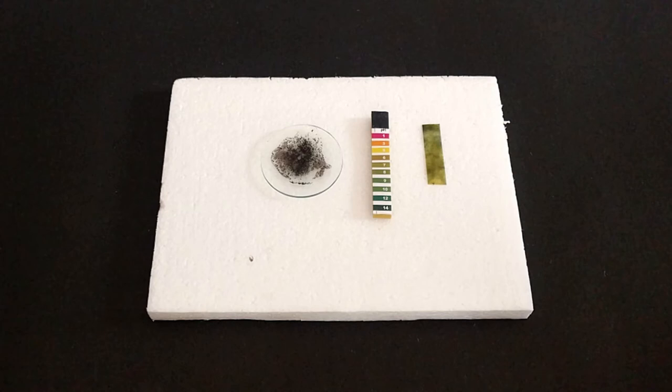Compare the colour of the litmus paper against the indicative key given on the pH paper booklet.